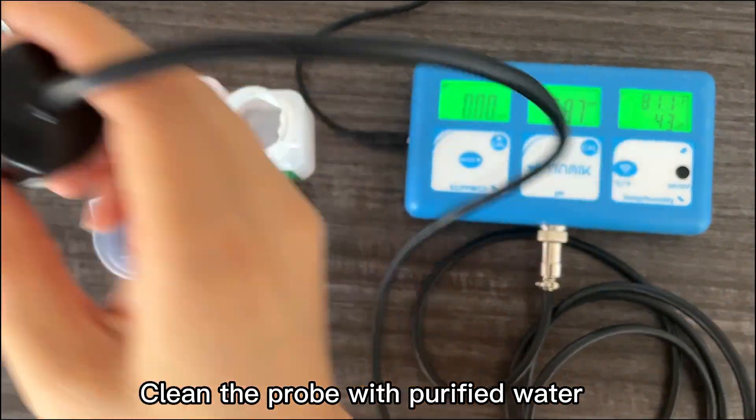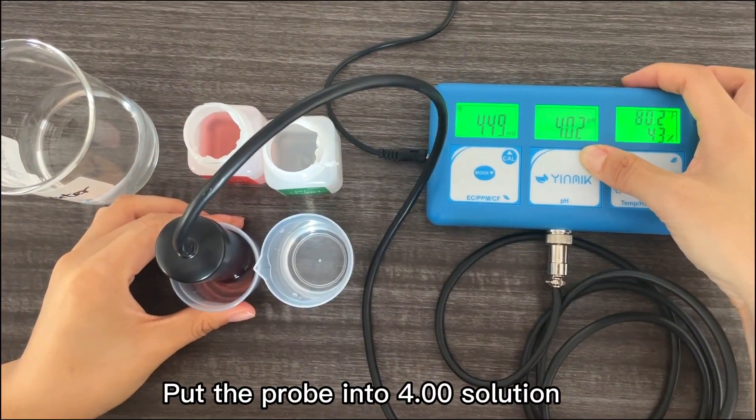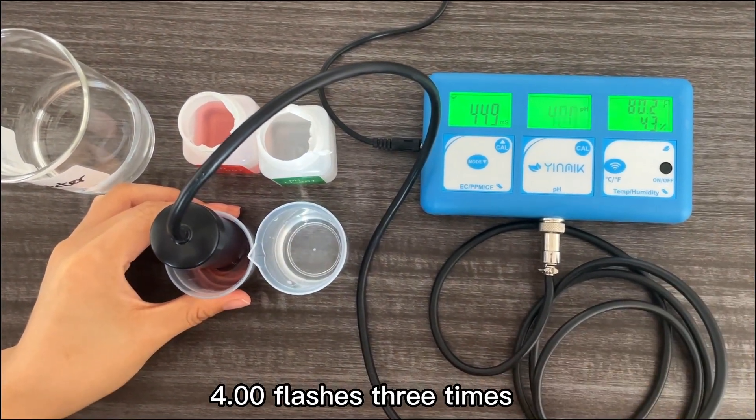Clean the probe with purified water. Put the probe into the 4.00 buffer solution. Long press CAL — CAL is flashing. 4.00 flashes three times, confirming the second calibration point.